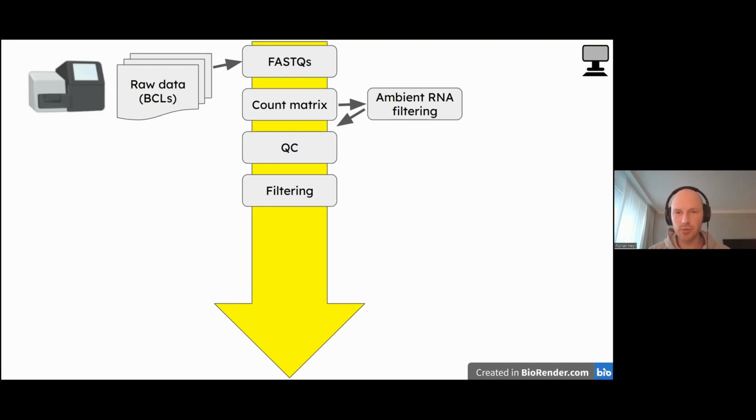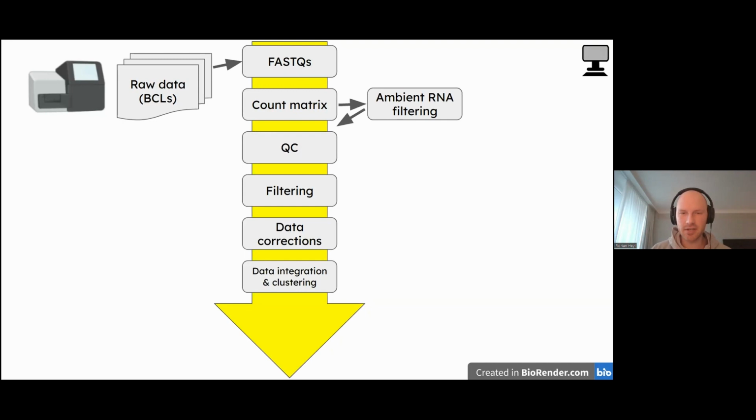After that, you do another filtering where you remove empty droplets, doublets, and other things. And then you do a data correction, then your data integration and clustering.